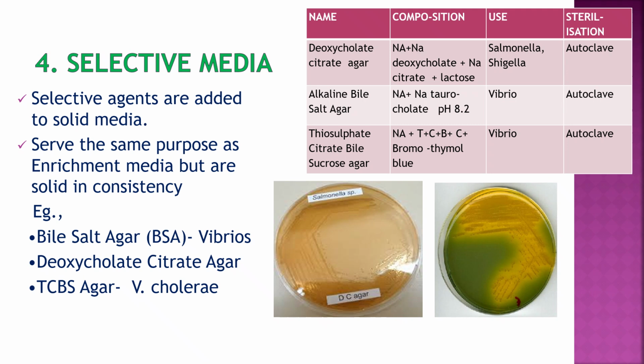Selective agents are also added to solid media, which act as an enrichment, but they are solid in consistency. So they are bile salt agar, deoxycholate citrate agar, and TCBS for the Vibrio.